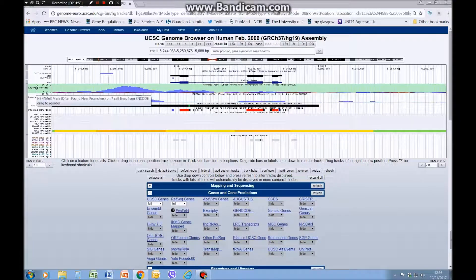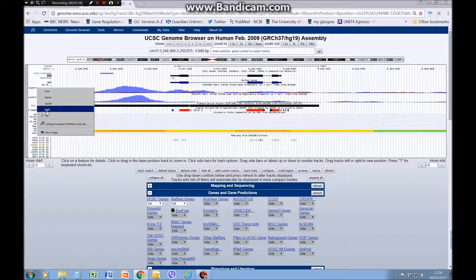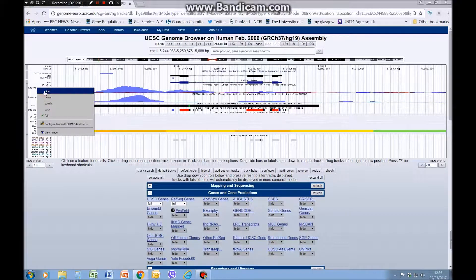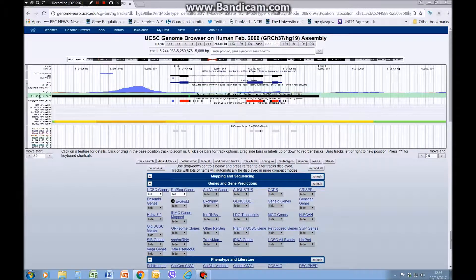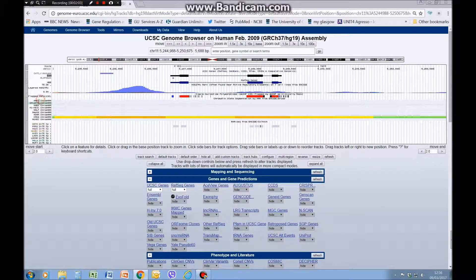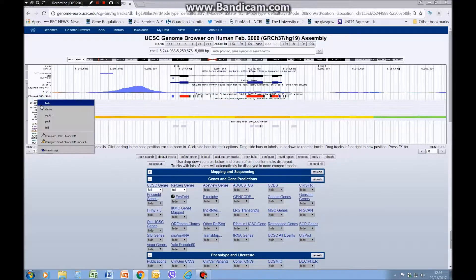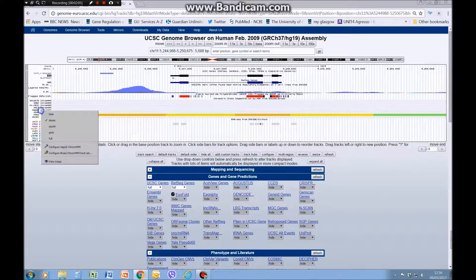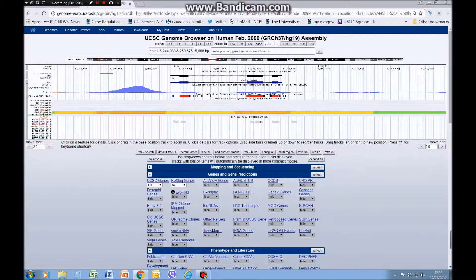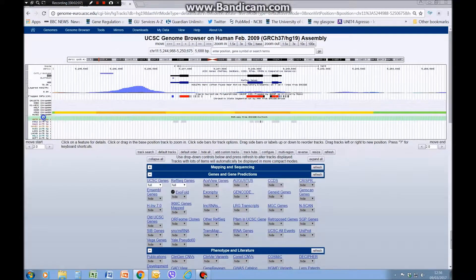If you hover over the left-hand column of a track and right-click, you can change the view. I'm going to get rid of the tracks we're not interested in for now by going to hide for all of them.